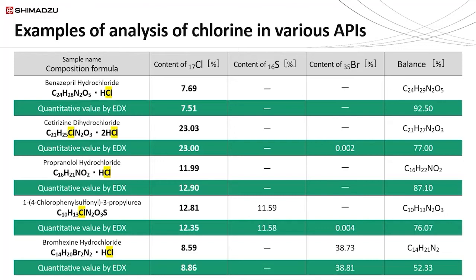And so for applications that are, for example, a screening application where it's not incredibly important that part per million type levels need to be known, this method works. And so this customer actually uses this fundamental parameter method as a screening tool to check that the chlorine or chloride value is within a nominal or sensible range, so that the product can be further assembled into, for example, a drug like a tablet or a pill.